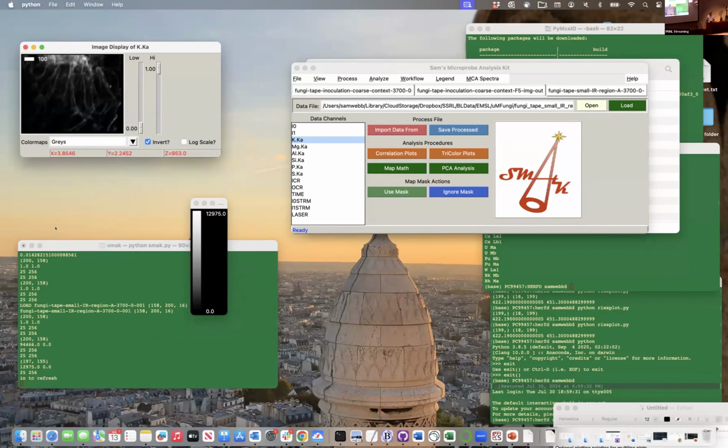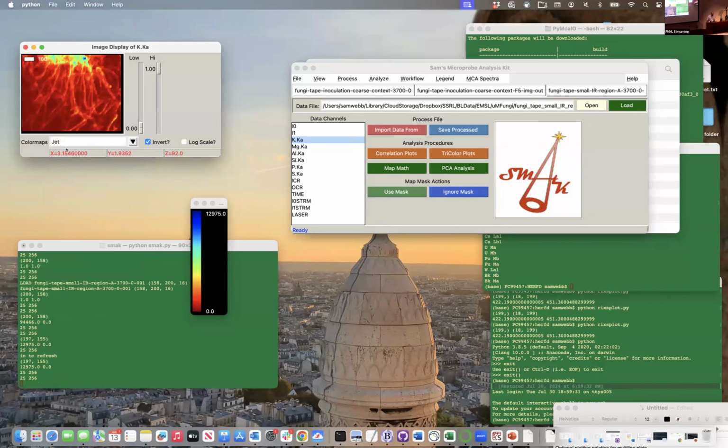There we go. So this is a high-res version of that corner. Let's go back to a color map that we might enjoy better to see those dynamics. There we go. Don't need to invert it. There we go. Now, again, if we maintain the same focus, the same levels, these coordinates should be exactly the same, and we can just import this map right on top of the other map.